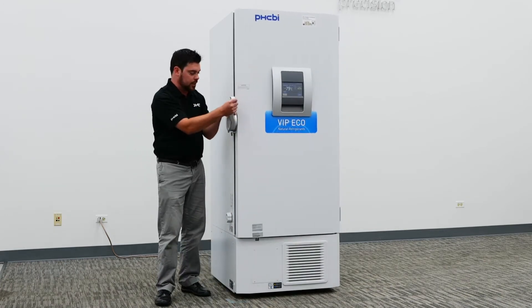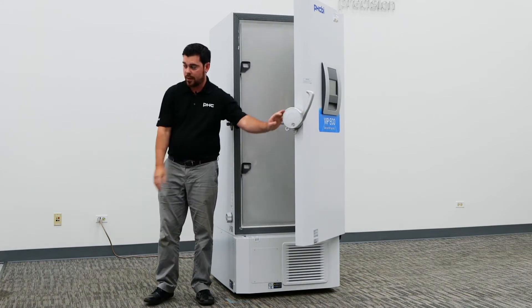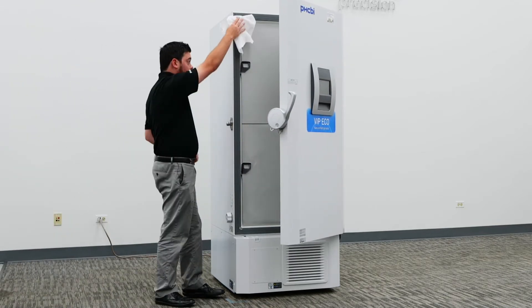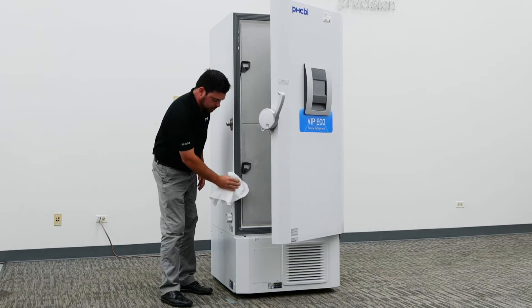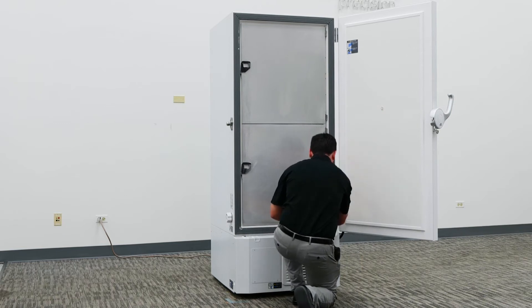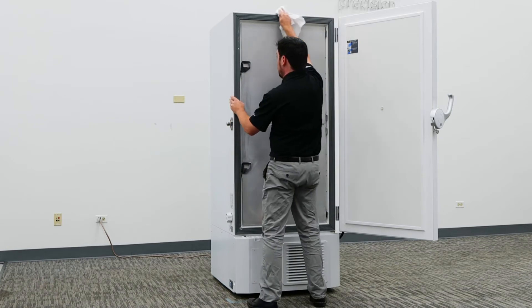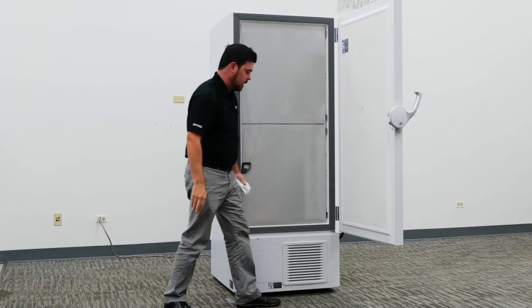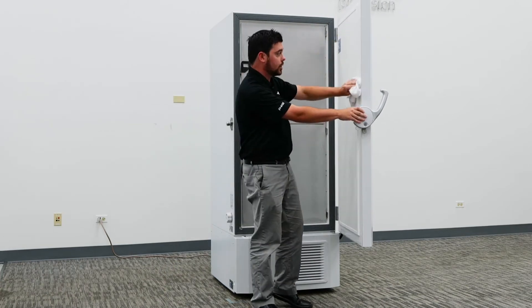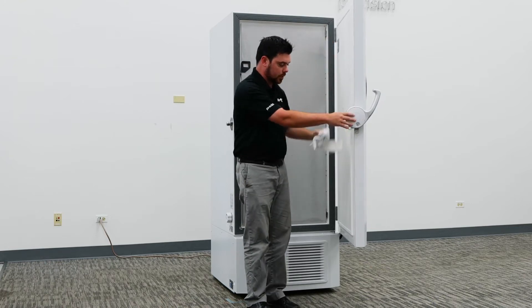One simple way to make sure the gasket is making adequate seal is to take a dry cloth and simply wipe around the entire frame of the freezer. Depending on the model you have, you might also have another gasket on the side of the door as well. Follow the same procedures and make sure that everything is sealing properly.